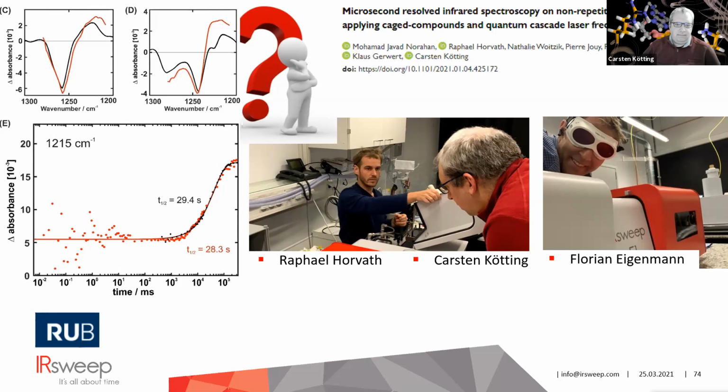I think that's one of the big advantages, as you outlined, that you can really go through thicker samples. And as you said, 60 micrometers we measured already. It depends a little bit on the solvent. But for the proteins, we have to use water, which is a very strong absorber, right?